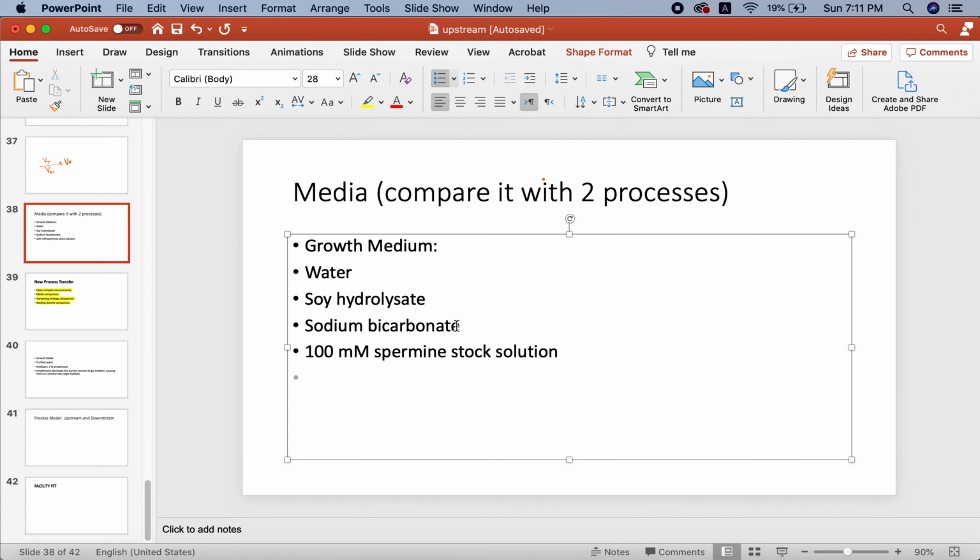Culture bag process. So the angle is 10, rocker speed is around 20, overlay percent CO2 is 5%, flow rate is 0.3 liters per minute, inoculation density is around 5. Controlled seed bioreactor, target is 6.